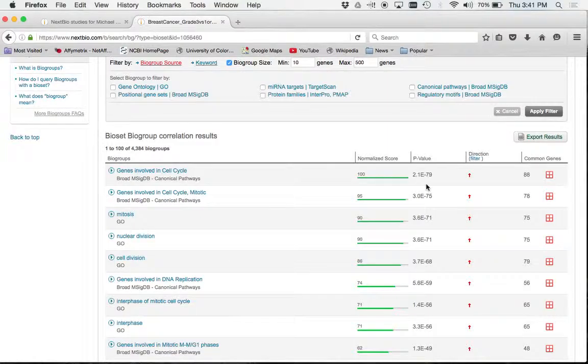And when you see p-values, this is why this meta-analysis works so well. I've noticed when you take a large group of studies that are looking at the same thing, and you take pieces out of all of those and put them together, it's actually stronger than any individual study itself. Anybody heard of Sir Francis Galton and the Wisdom of Crowds, the bull? It's kind of the same theory. No one's heard of that? Oh. By the time I leave campus, everybody's going to know Sir Francis Galton.